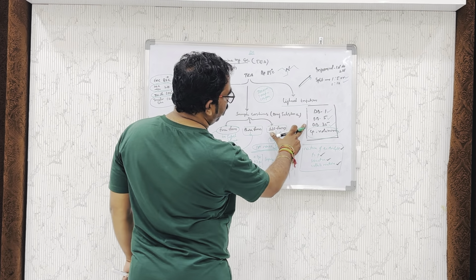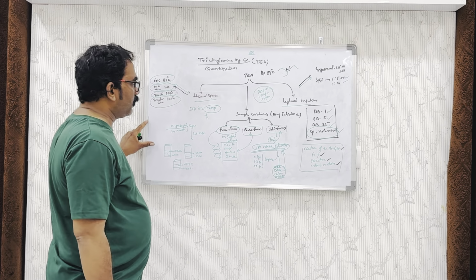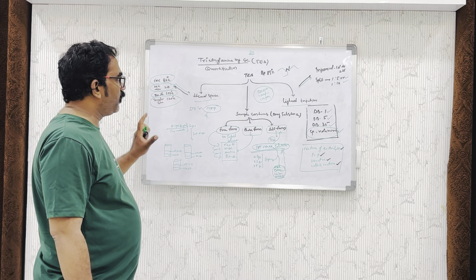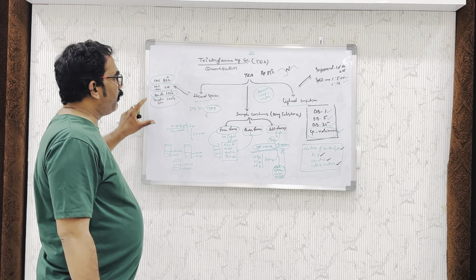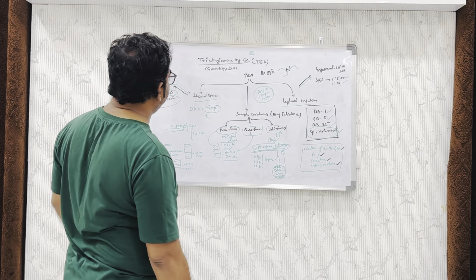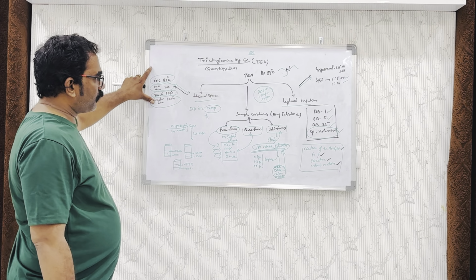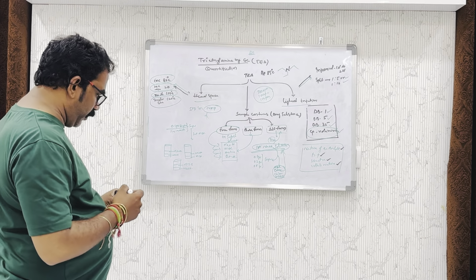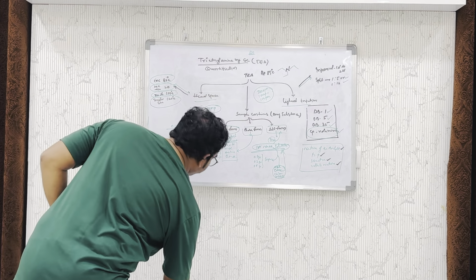The same method we can apply for drug substance also. This is a very simple quantification. There is no difficulty because all members know how to quantify triethylamine, but I am giving some explanation of how to quantify.